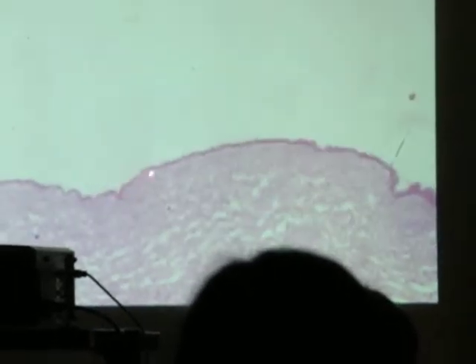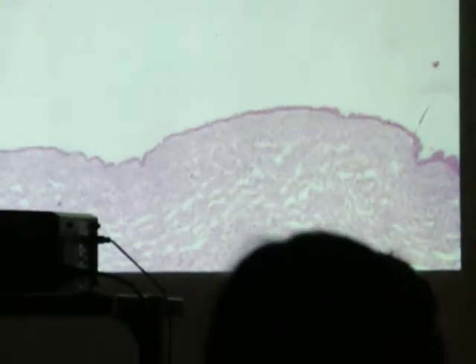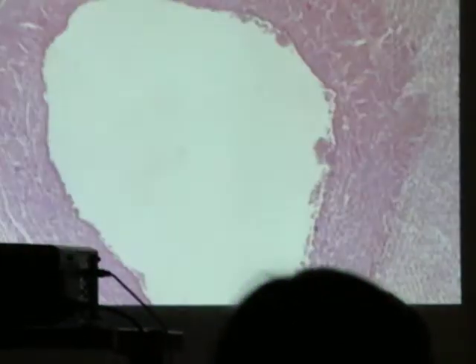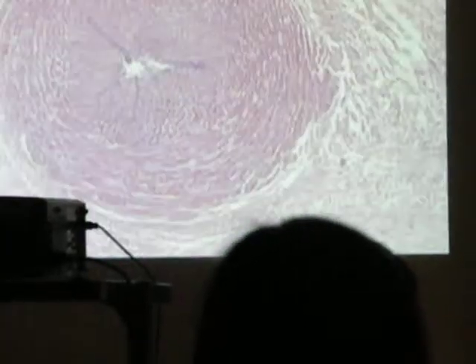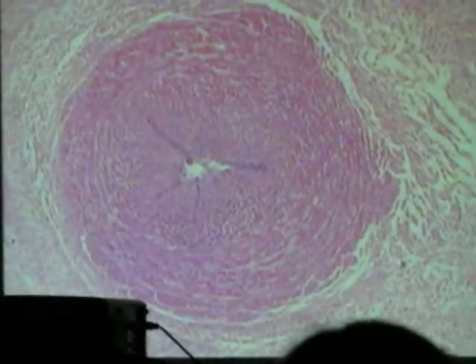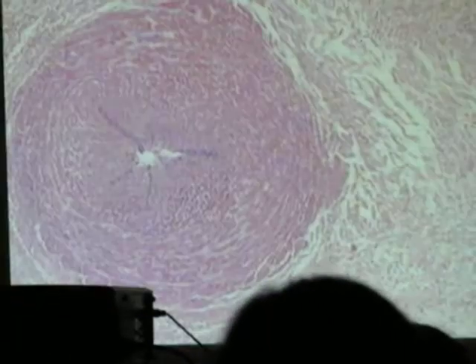Alright, there's a nice epithelium there. You can really see the outline of it. And all that background was jelly. Okay, here's this. Compared to that. And then over here. And that. So you should be able to tell the difference between the artery and the vein for these. So big, huge artery there.